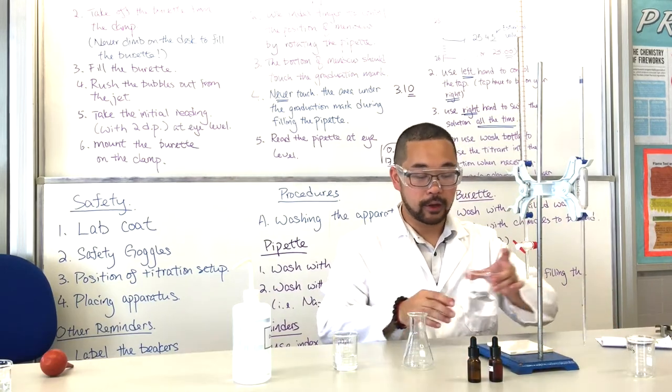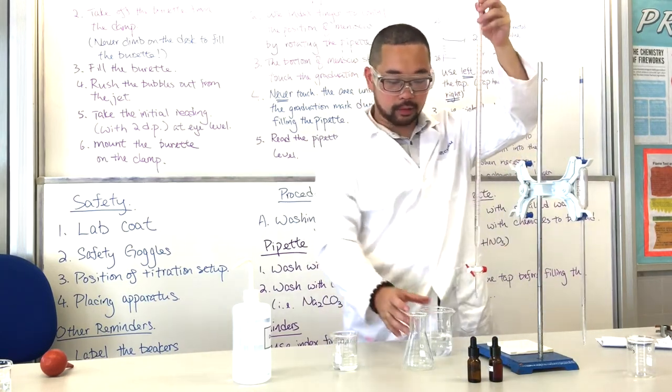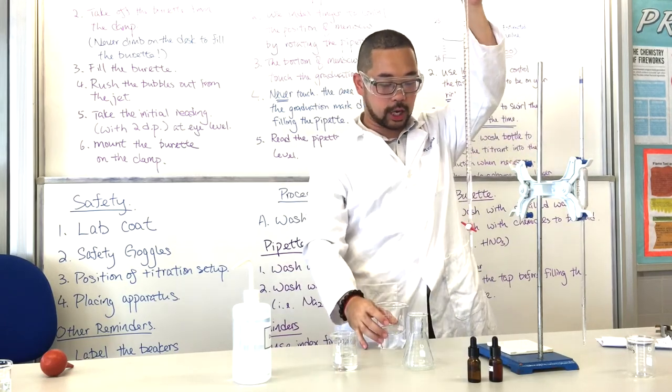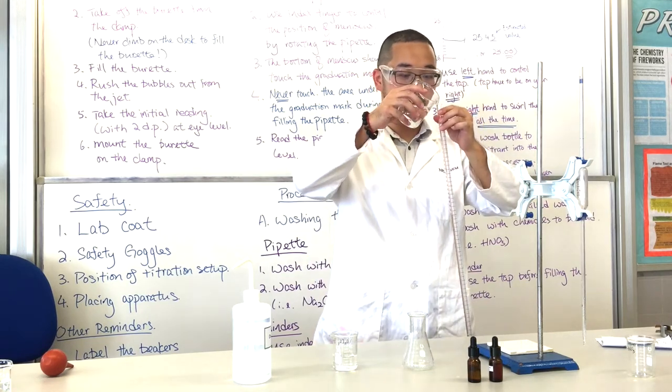First of all, you have to fill the burette with chemical. So first of all, you have to take it down. Never pour the solutions over your head like this. Make sure the tap is closed, and then you can pour the HNO3 into the burette carefully.